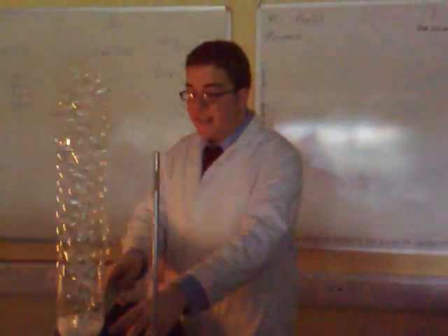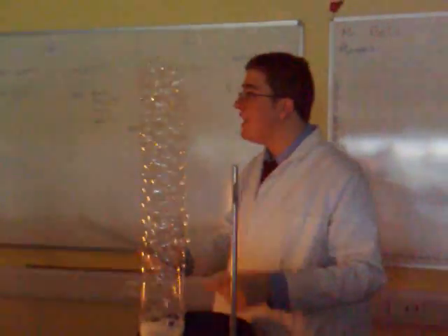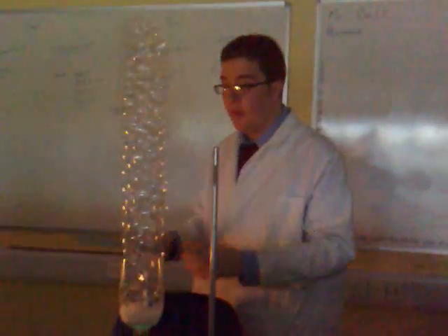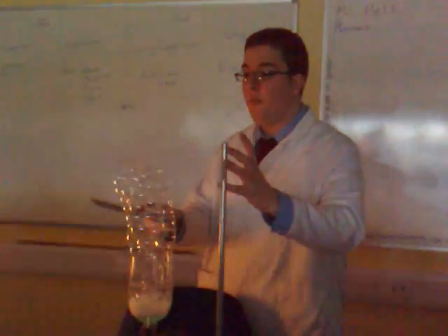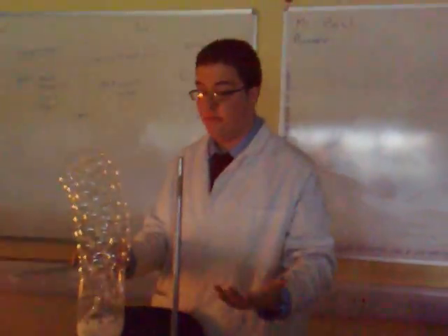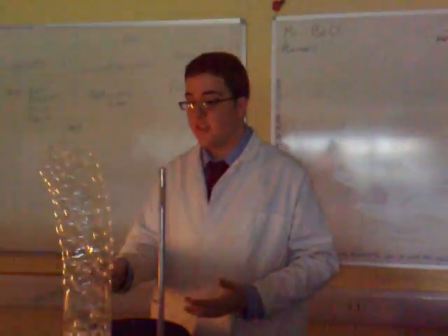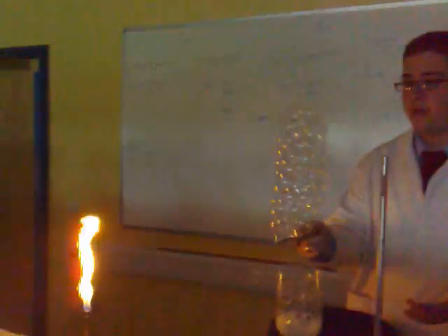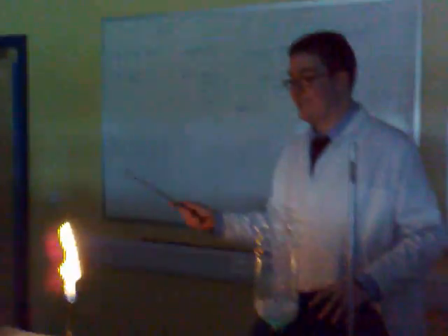Coming out of this gas up here we have methane. What we're doing is we're bubbling it through some washing up liquid and it's forming these things called methane bubbles, which is bubbles of methane. So what we're going to do is bring them into close proximity with the flame.